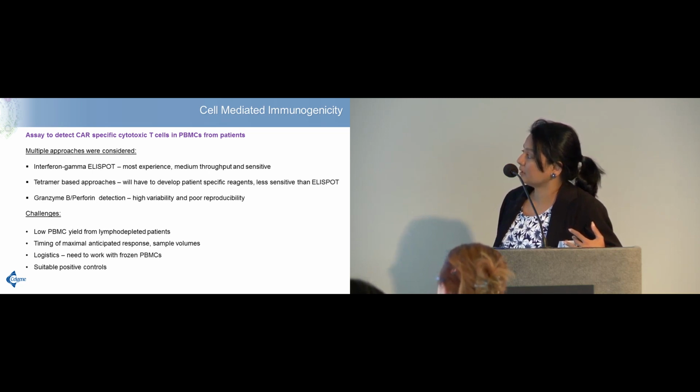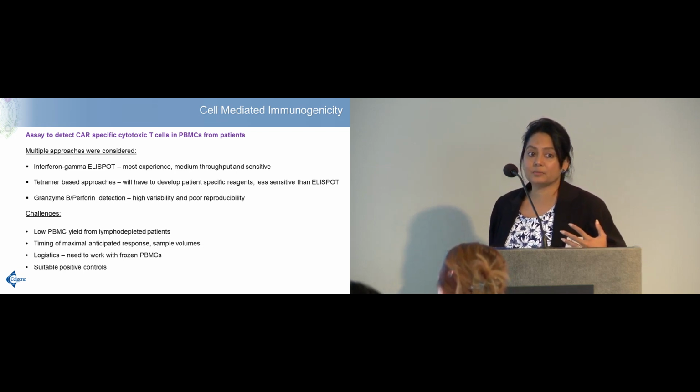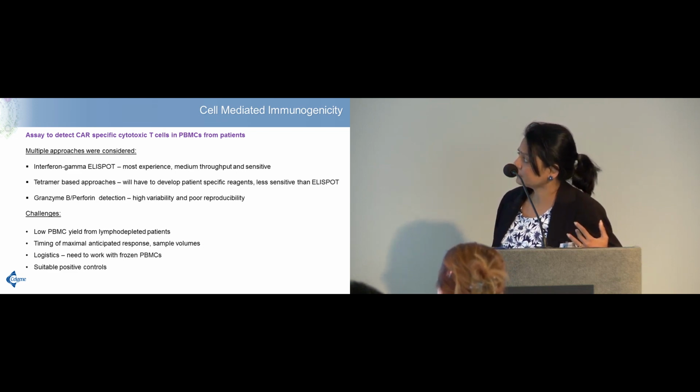And also we looked at some granzyme B and perforin detection. Our therapeutic here is a T cell itself. We had false positives and poor reproducibility. So we decided to stick to the ELISpot.